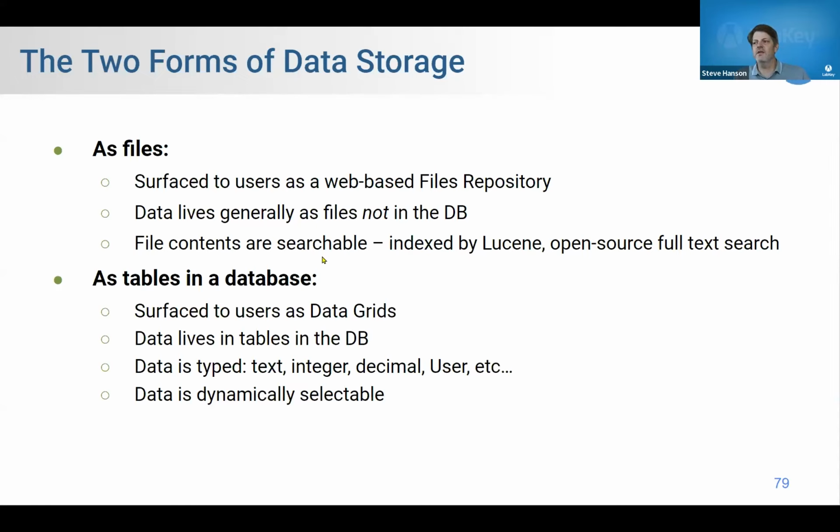LabKey stores data in 2 ways: as files and as tables in a database. We looked a little bit at each of these, but I wanted to circle back and look at these a little more systematically. The files are surfaced to people through a web UI, through that file repository window, that Dropbox window. We've been playing with it. There's a lot you can do with it.